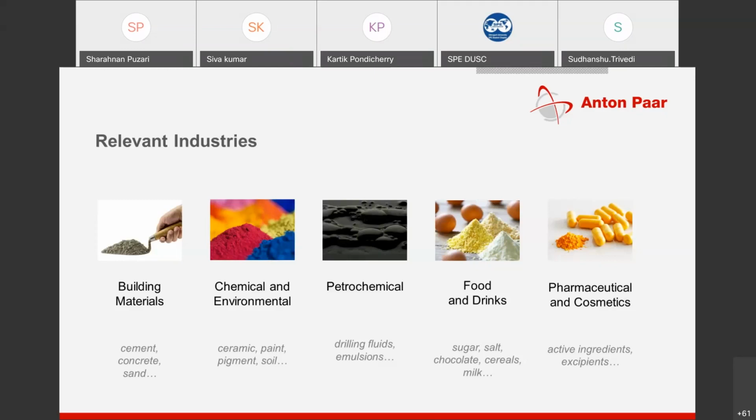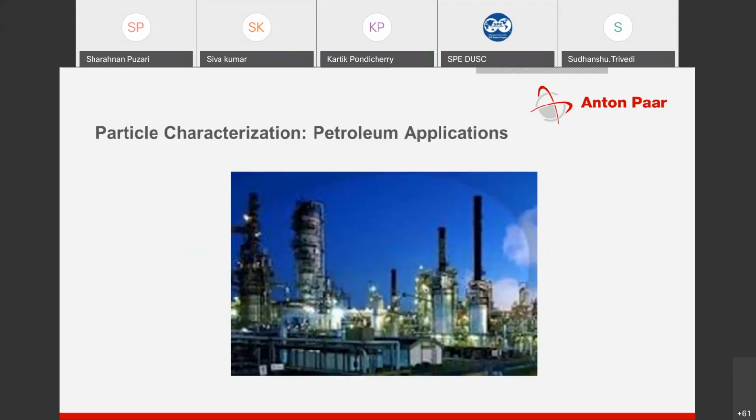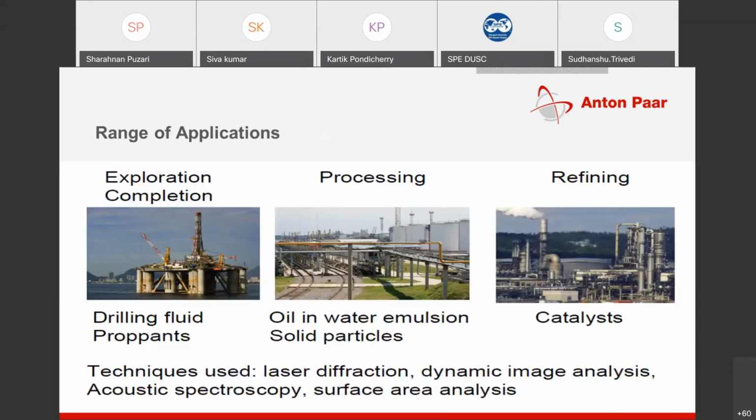Now I am talking about the petroleum applications. Actually, there are many applications in petroleum for particle size analyzers, including laser diffraction based particle size analyzers. If I talk about the petroleum industry, the range of applications comes from exploration, completion, processing, and refining. In all these stages, you require particle size analyzers.